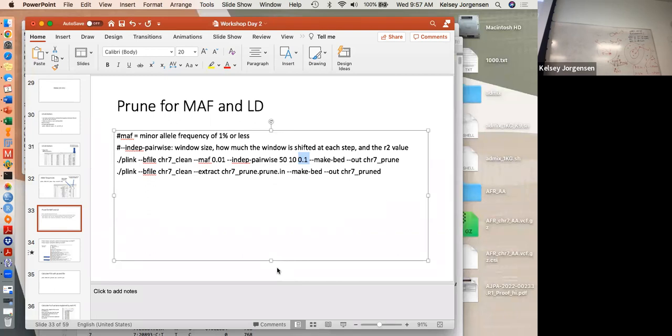Yeah, those need to be in the same folder, and then that should work. Try it with the dot dash. It's clicking that folder, because usually I get that flag when I can't click around. Maybe just put it in there.